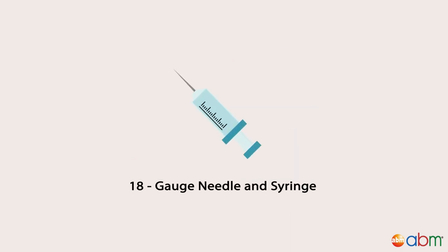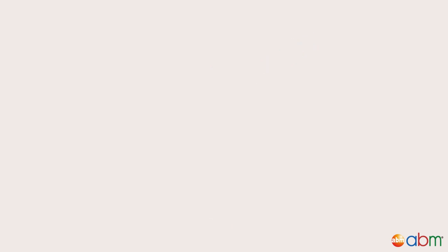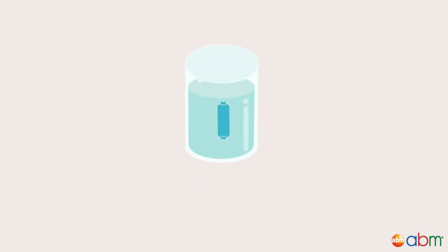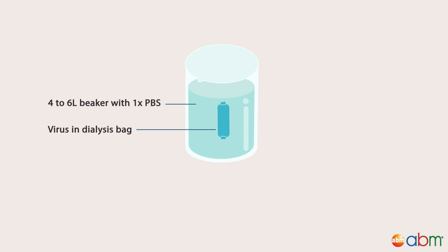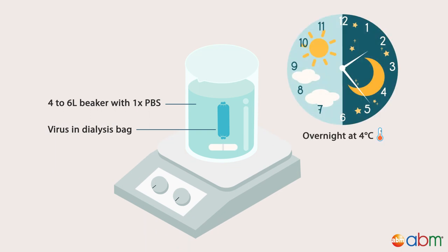Use an 18-gauge needle and syringe to release pressure at the top of the tube. Carefully extract the virus solution using the same needle from between the 25% and 40% iodixanol layers. Next, transfer virus preparations into a pre-wetted dialysis bag and dialyze in a 4 to 6-liter beaker or flask against 1× PBS or the final desired buffer. Place the setup on a magnetic stirrer overnight at 4 degrees Celsius.